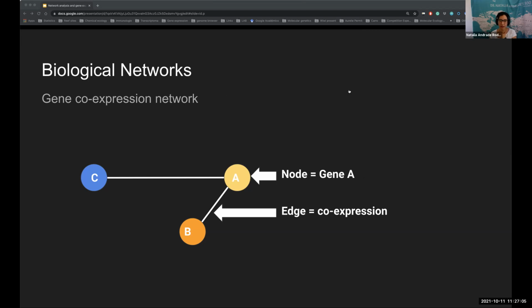The same concept of protein interaction can be used for gene expression. As I explained in the introduction, networks are used to find unknown functions of a gene, or to validate the functions of genes through knockdown.